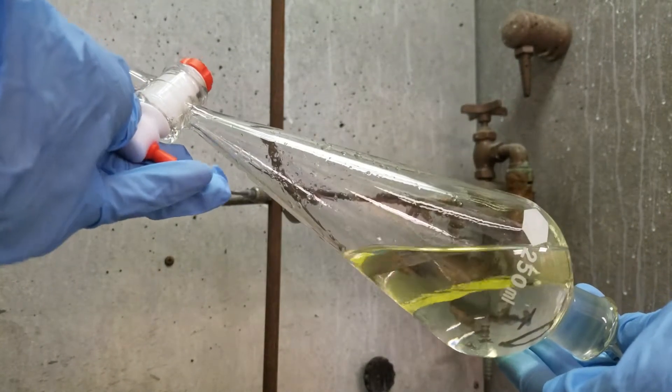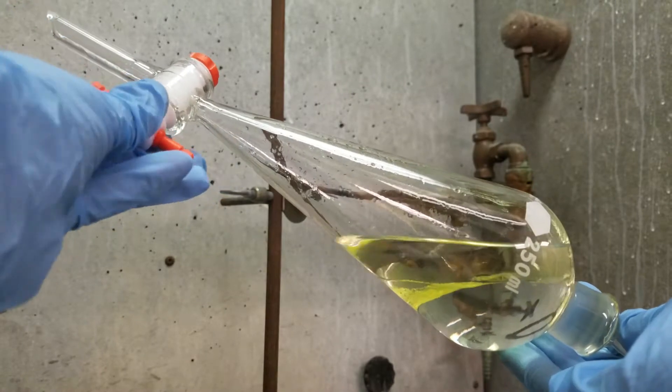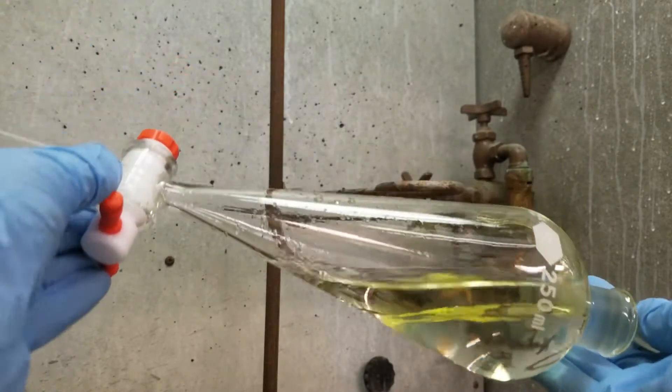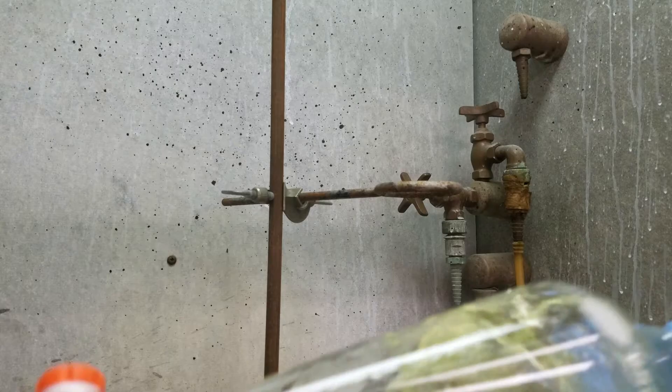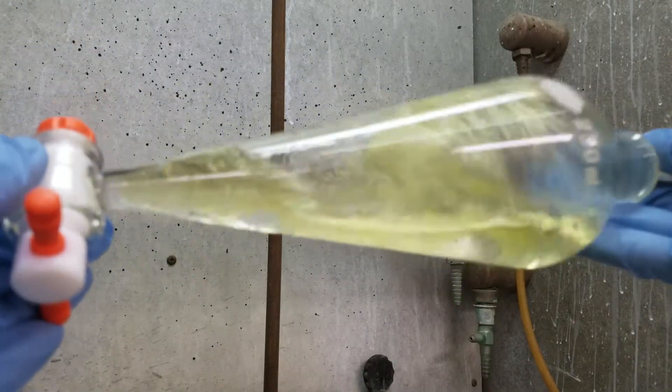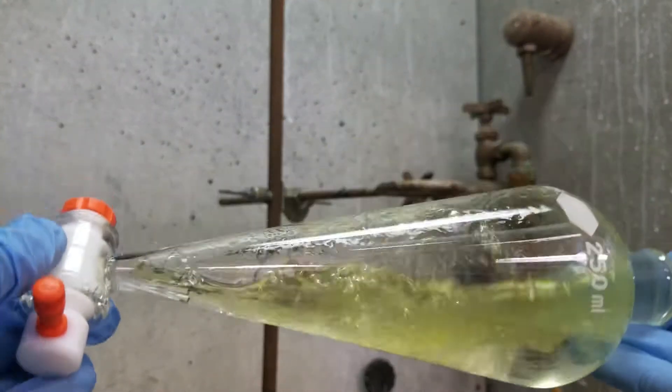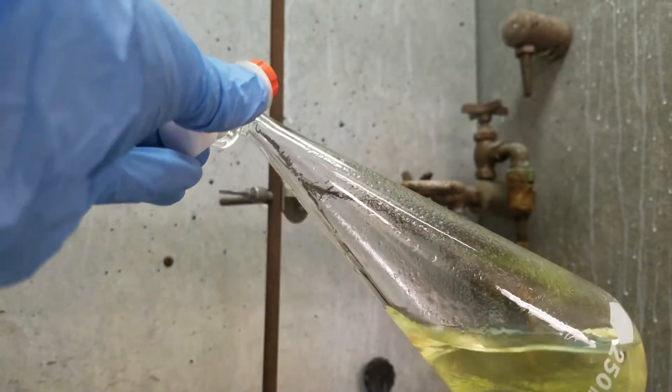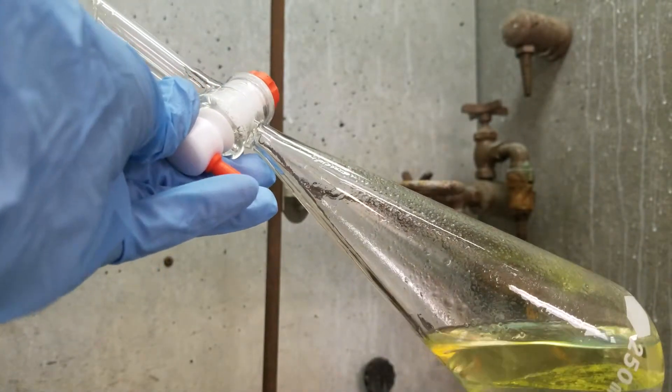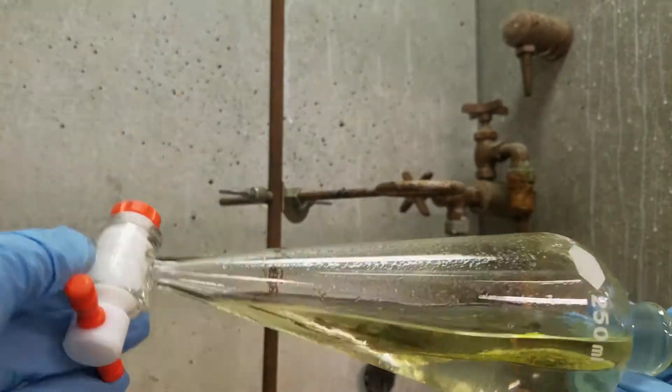Slowly open the stopcock and allow for any pressure built up in the separatory funnel to be released. Once pressure has been released, close the stopcock and shake the separatory funnel. Again, invert the separatory funnel and release any gas that is built up. Repeat this process several times until pressure is no longer released when opening the stopcock.